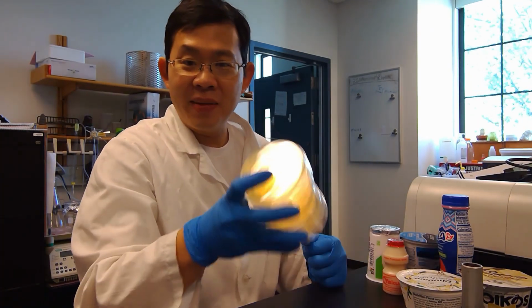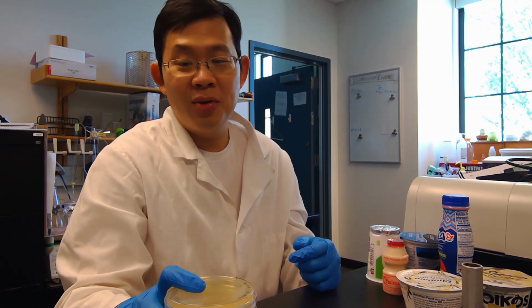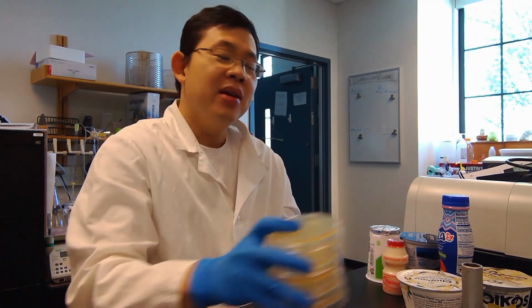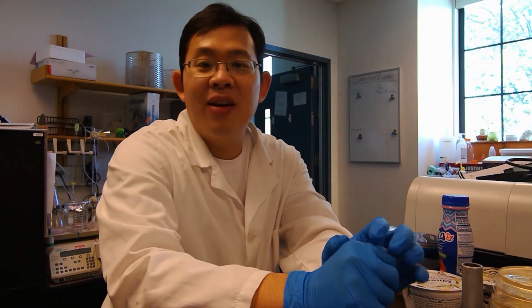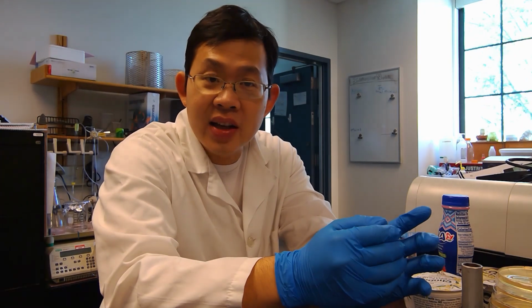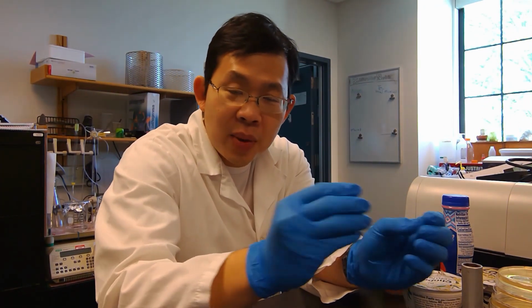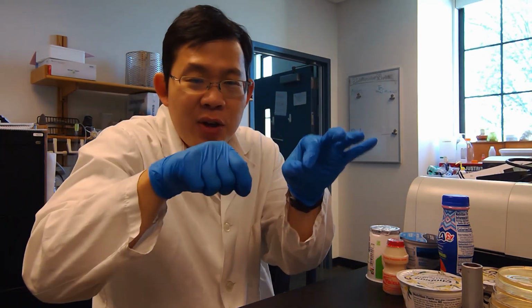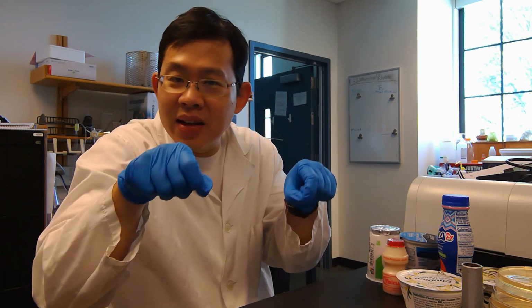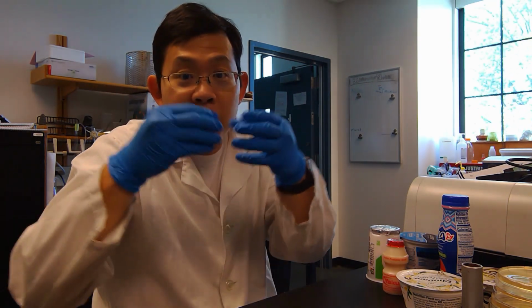Now that we have all the plates labeled, we are ready to perform streak isolation. In the classroom, you may learn different versions of streak isolation. Again, the purpose of streak isolation is to separate the microbes from each other so that individual cells land separately on the plate, and that individual cell later on will grow.